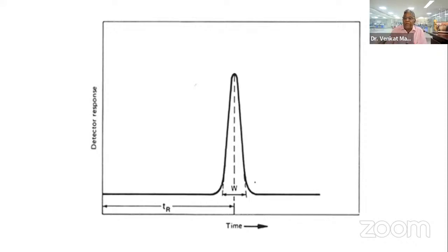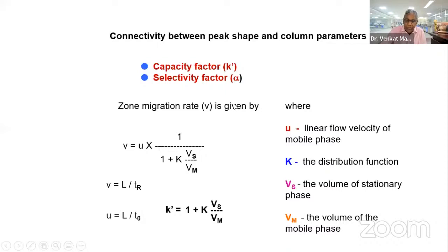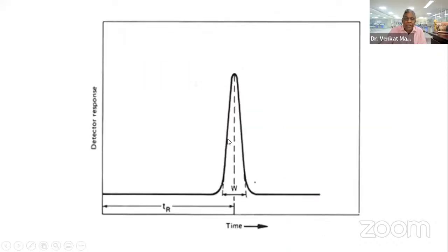When they superimpose upon each other, it will appear as if it is a single peak, which means from the center of the apex of this peak, at each portion, you can very clearly see that the upslope as well as the downslope are equally spaced.